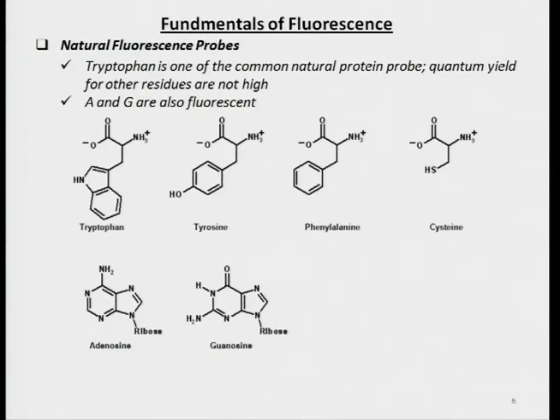Practically every protein would have a tryptophan. Just because the tryptophan is there doesn't mean the protein would fluoresce. You have to have some change.